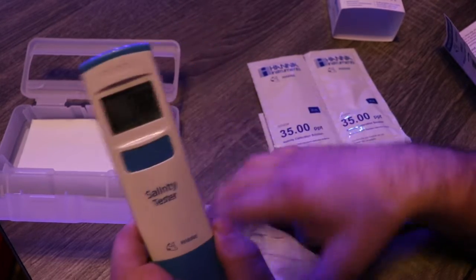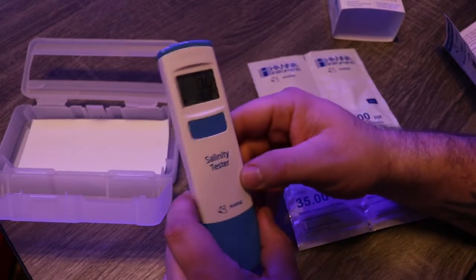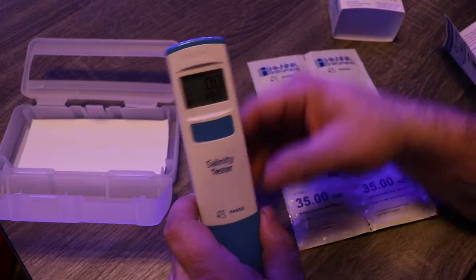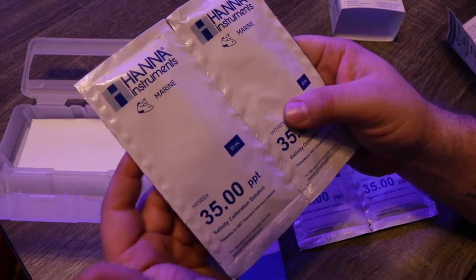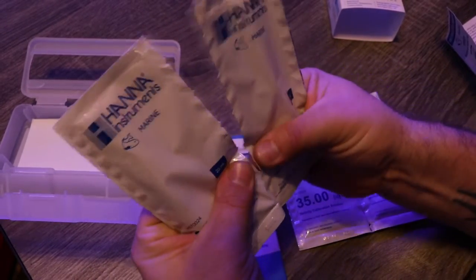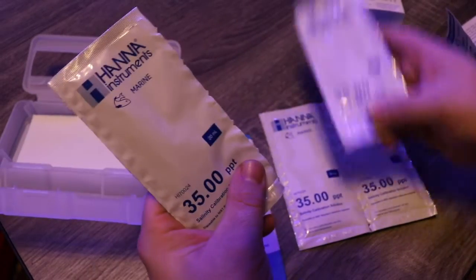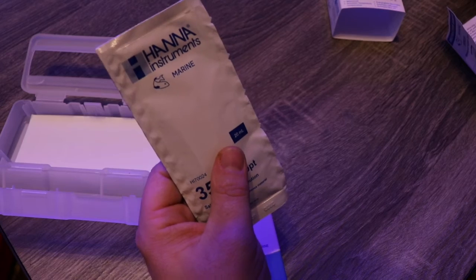The first time you use the tester, make sure you rinse it with DI water prior to turning it on, and they recommend that you calibrate it the very first time. They provide the calibration solution, which is very helpful, and they recommend calibrating the Salinity Tester every month.